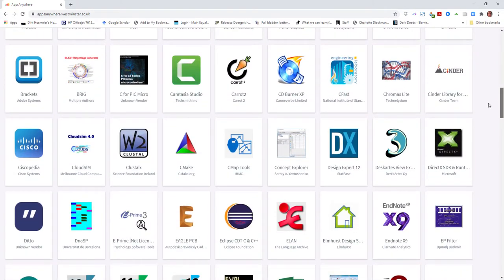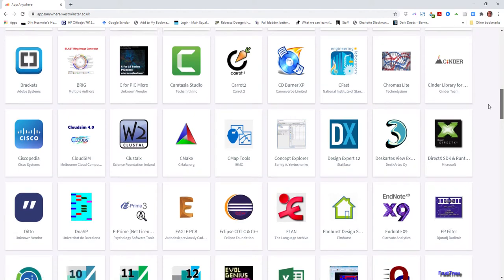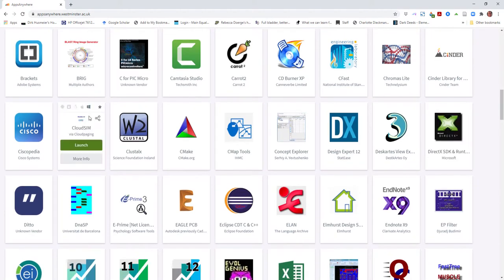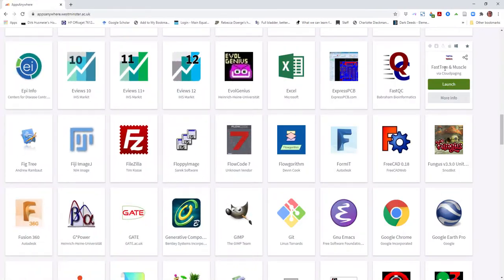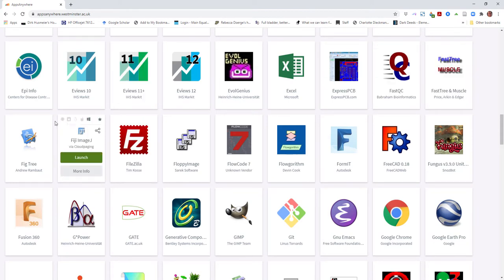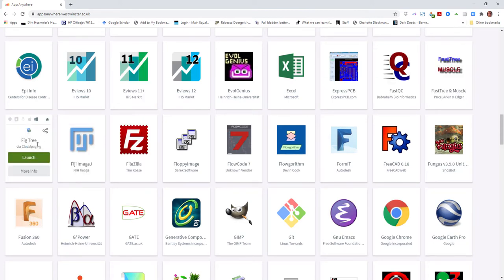The programs that we really need to use are FastTree and Muscle. FigTree is also available, although this won't be the most recent version. You can use this version if you find that when you try to download it for yourself, it doesn't work. This is a possible alternative.